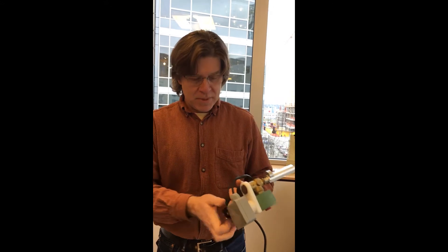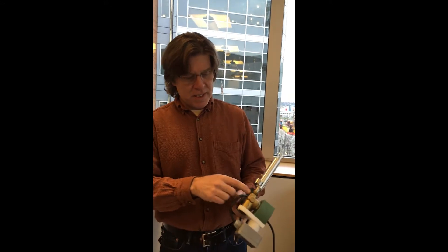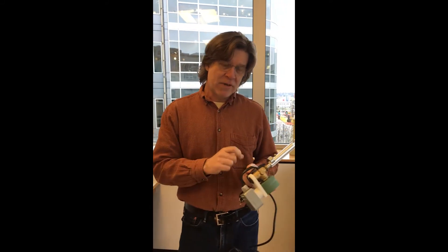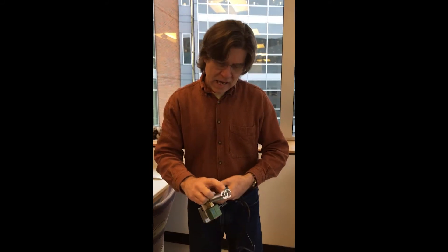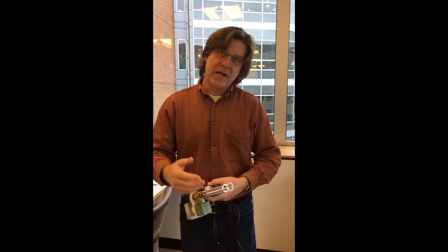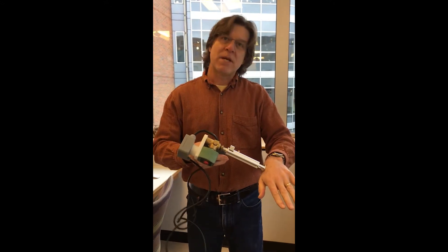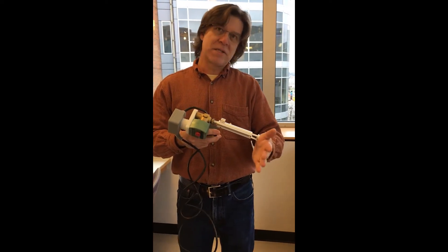Basically what happens is when the helium is released, it goes through those little cartridges, rips the gold beads off of the cartridge, and they go flying down the end of the barrel of the gun and they hit whatever you have the end of the gun pressed up against.